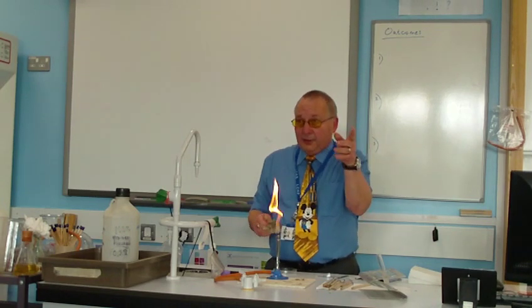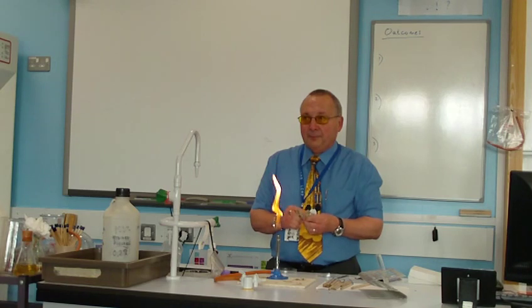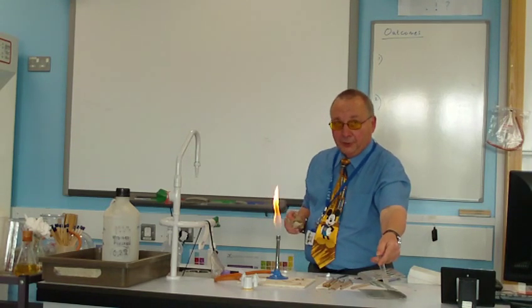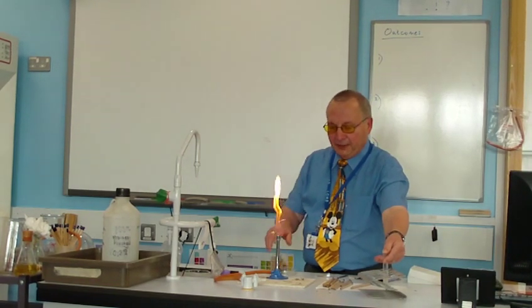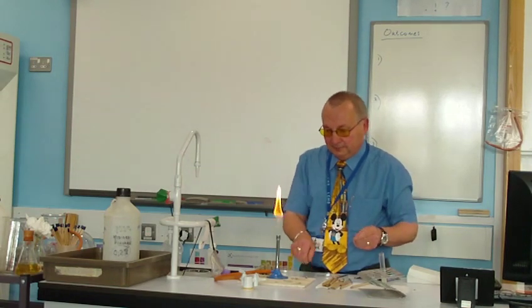I'm going to light 3 Bunsens. I'm going to put a splint there. Don't pop it in till I've got the Bunsens ready. Then you'll pop it in there. One will have the thumb over. How long will you have it in for? 2 or 3 minutes. When you can feel the pressure, the other one puts the hand there.